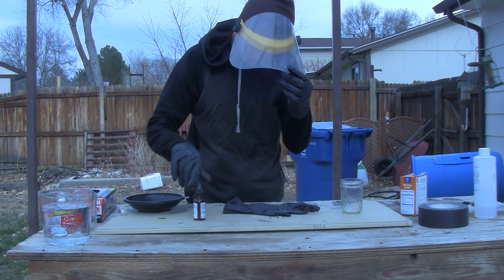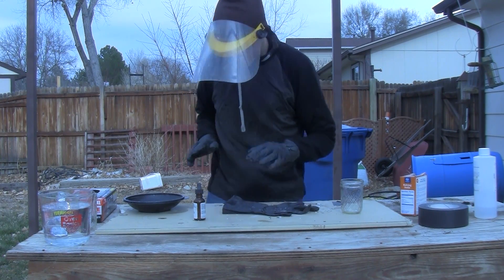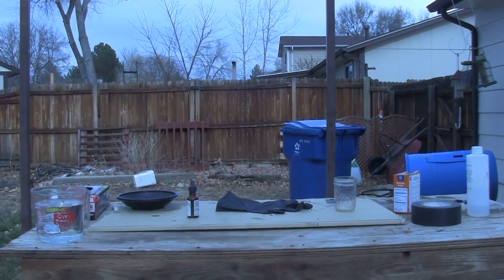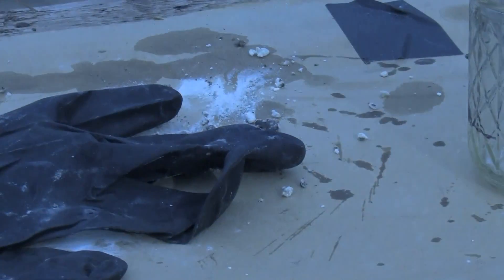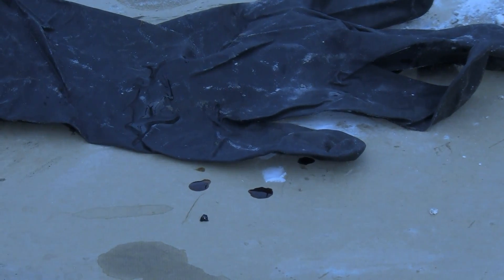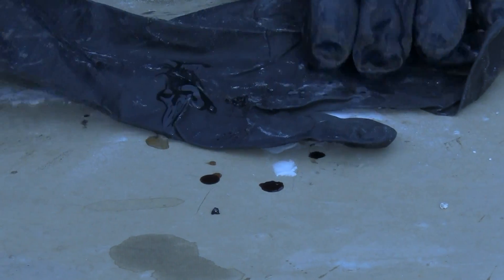As you can see, nothing much happened. I can assure you that I'm actually fairly safe, as nothing happens to the glove. You can see nothing much happens to it — nothing happens to the glove at all. So I can safely say that no harm should come to me if I get a little bit of it on me.